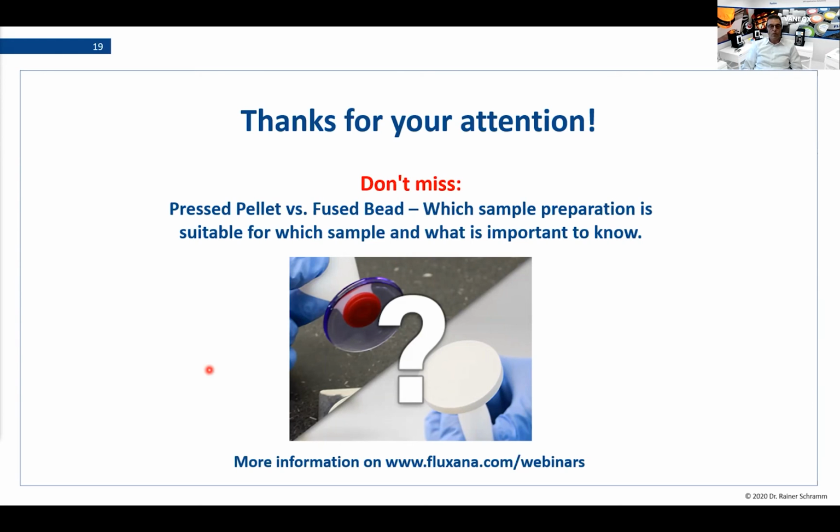So then I have another question. Is the correction sample the same as the reference material? A correction sample, I think you mean drift correction. The drift correction would be an extra sample which is independent of the standard materials, because there we would like to see high intensities. And normally you use glass samples today because they are stable for a very long time, you can clean them easily, and they could also be replaced if necessary.